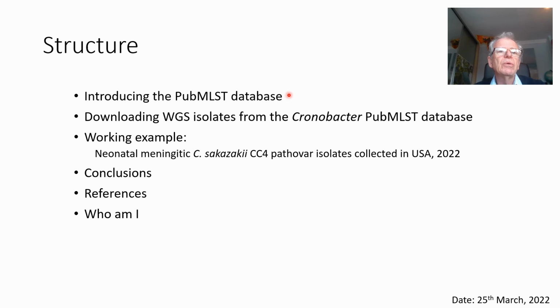So the structure: we're going to look at the introduction to the PubMLST database, just show you some different angles that you can approach it from. Then I'm going to show you how to download whole genome isolates from the database. We're going to do a working example of the meningitic CC4, look at some conclusions, references, and who am I.